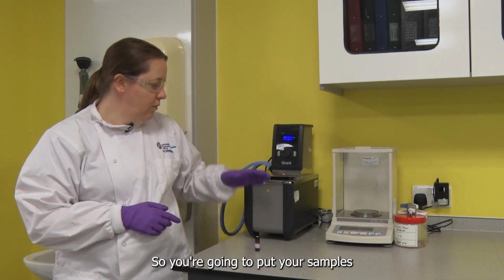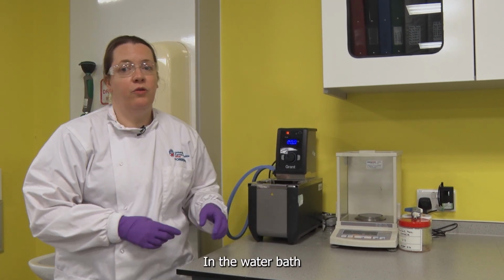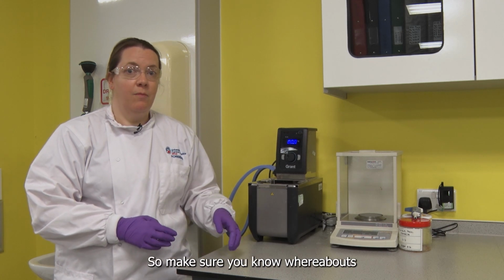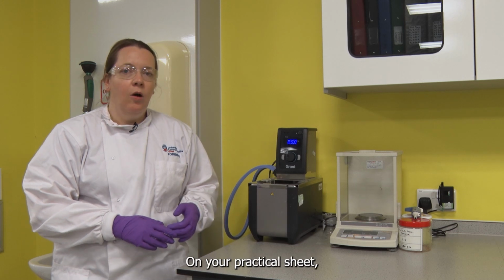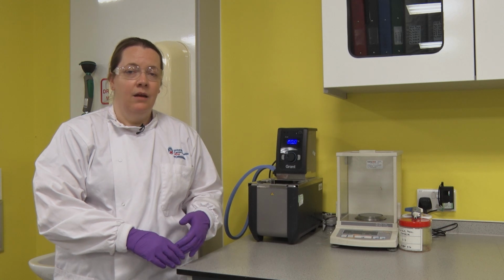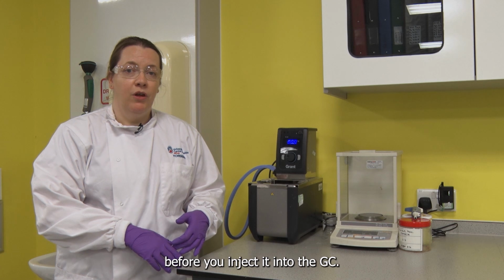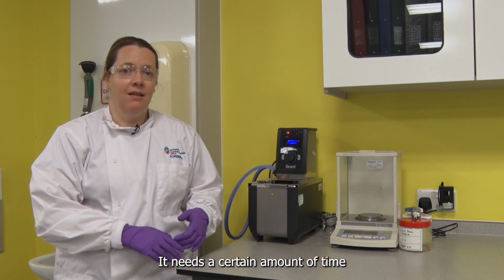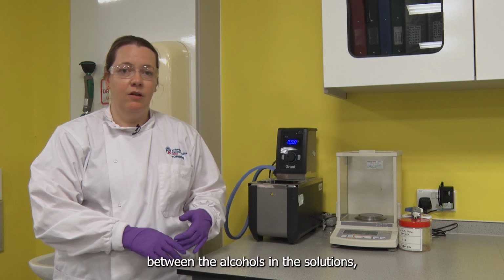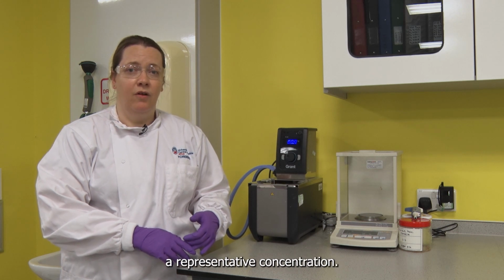on the GC. So you're going to put your samples in the water bath. So just put that one in. In the water bath there is a tray. It'll hold all of your samples. It'll hold other people's samples. So make sure you know whereabouts you're putting them in. On your practical sheet it will give you the minimum time you need to have your sample in. And you need to make sure your sample's in for at least this time before you inject it into the GC. It needs a certain amount of time to set up an equilibrium between the alcohols in the solutions and being in the headspace so that you can get a representative concentration.